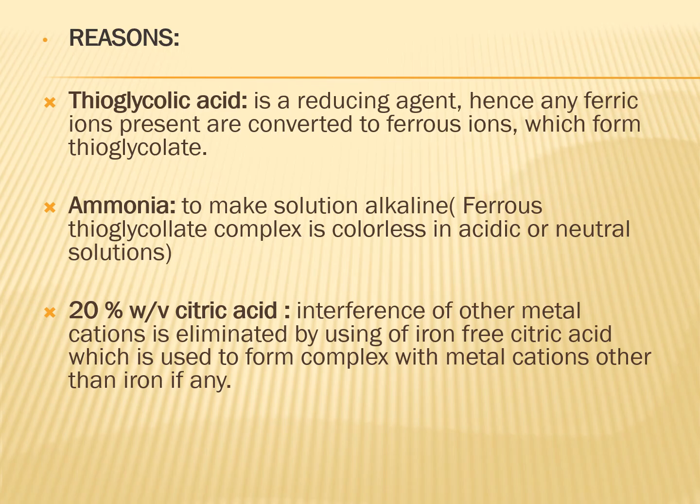Next, we are adding ammonia. As I already mentioned, ammonia makes the solution alkaline. In an acidic or neutral solution, the ferrous thioglycolate complex is colorless, so we can't identify or detect the color change.